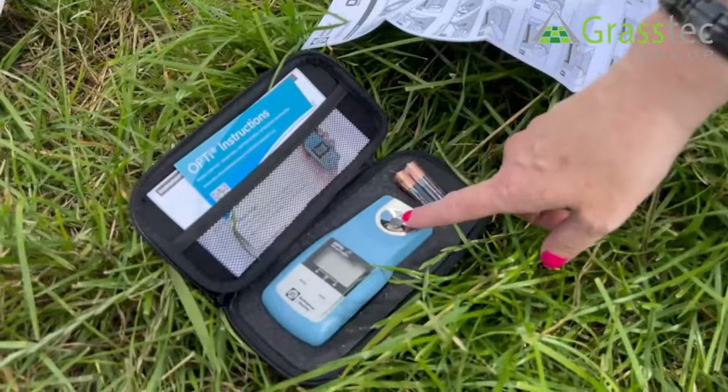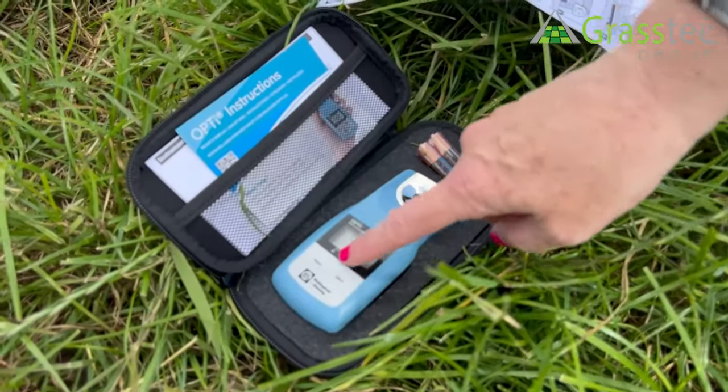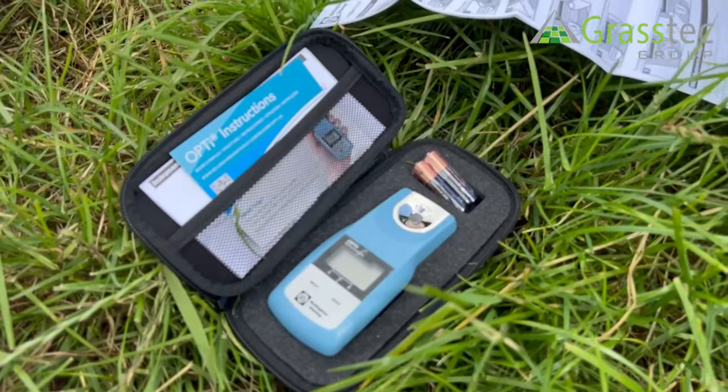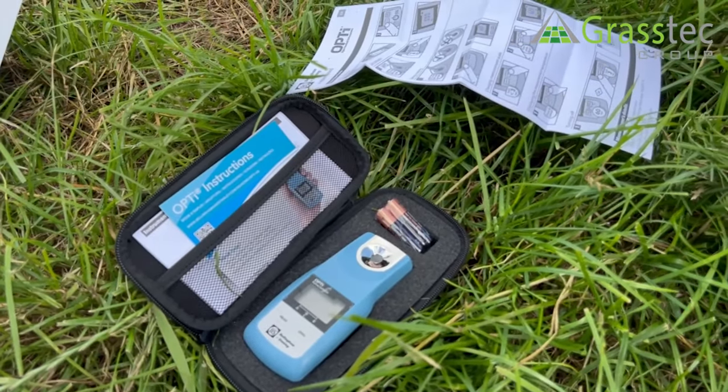You just put your sample here, press read, and depending on what you're reading — A, B, or C — you have your results: either grass sugars, colostrum, or antifreeze.